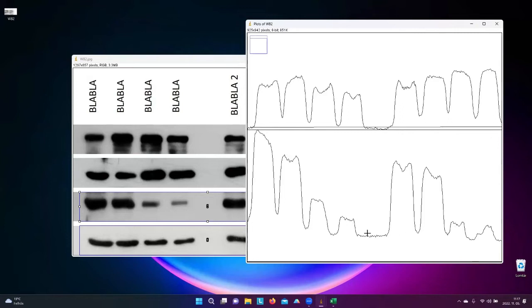So as you see, that was the first one, which refers to this one. This peak is referring to this one. This is the third one, and this is the fourth one. So I'm going to set everything to the fourth one and to here. So basically, I need to cut my gels like this. But if you see, this is not going to work because then I'm going to cut everything or most of the peak of the last one.